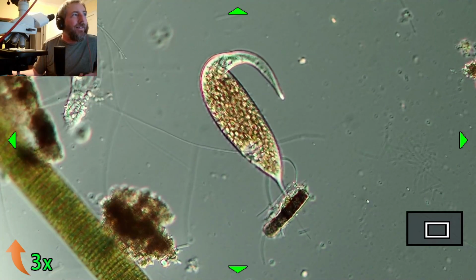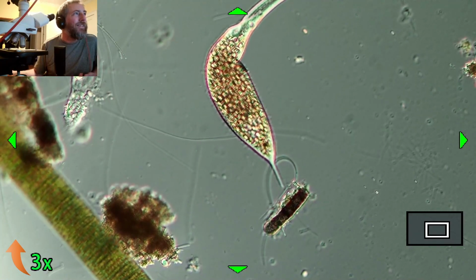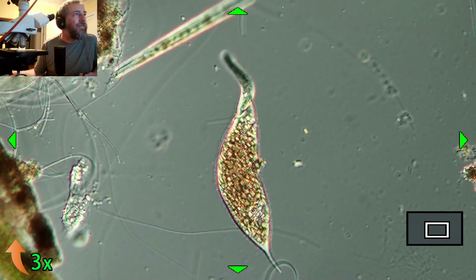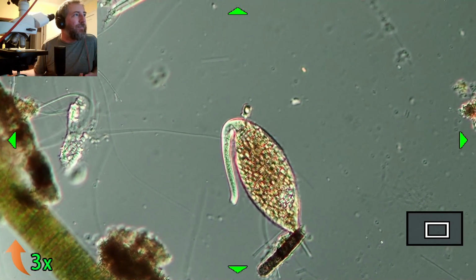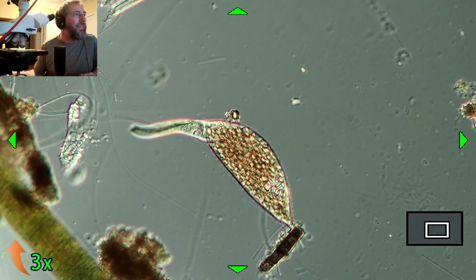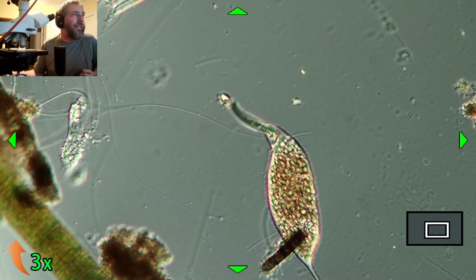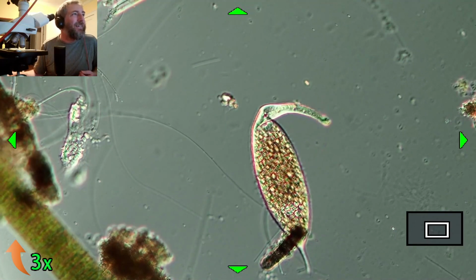See, yeah, this one is really cute, for a predator. There you can see the little bubble-like structures running down its side of the neck. Really fortunate, it'll open up the mouth, and it's a really kind of frightening display because it has a cone shape to it, and if it flips over at just the right angle and finds something to eat, it will open it up and just swallow it. It's pretty cool.